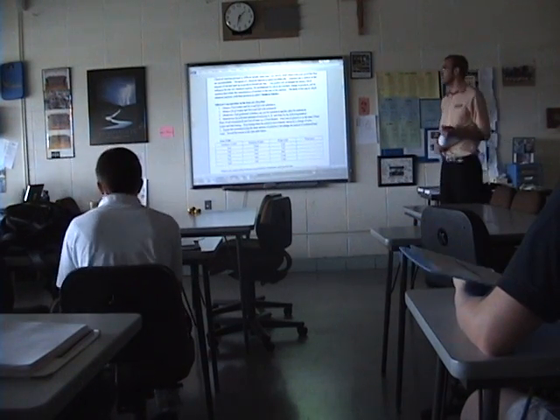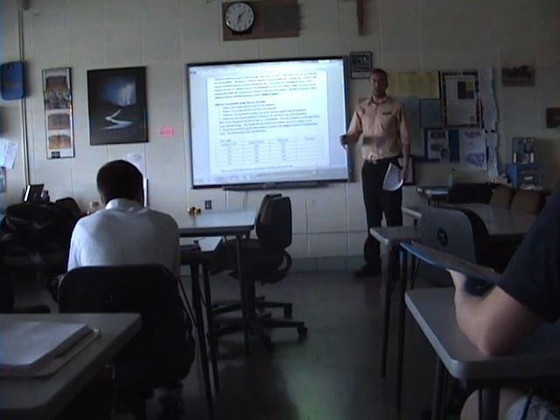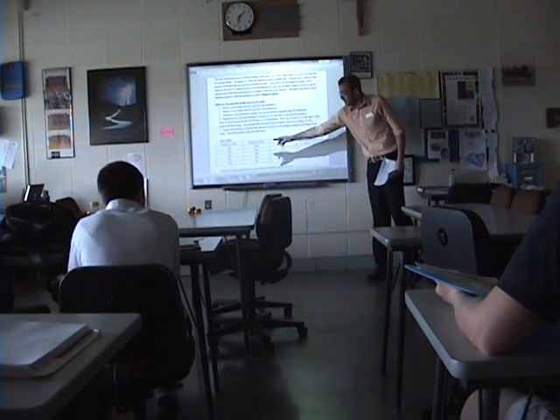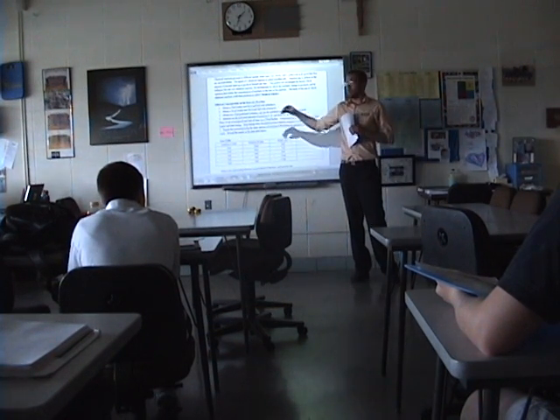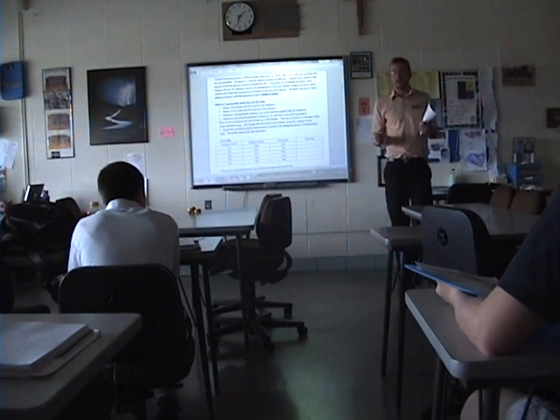In order to do this, you're first going to do the first 2 steps. Basically, you're just getting a stock solution for your little lab station. You're going to go over to the big jar and get at least 25 milliliters, a little bit more, because you're going to be putting 5 milliliters of each into your stock solution. Then after that, you're going to get 2 10 milliliter graduated cylinders for each of those stock solutions. Don't mix them up. If you mix them up, that reaction is going to start.